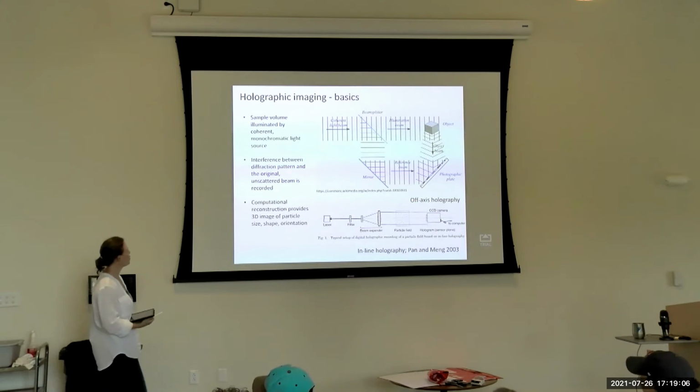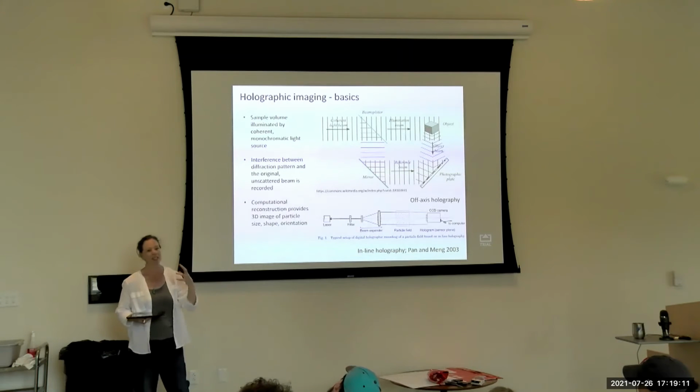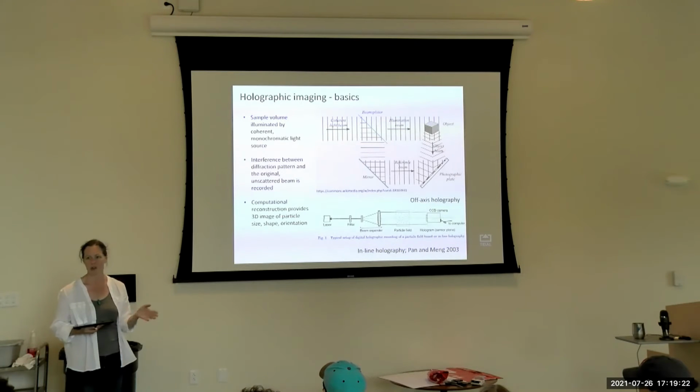So the 3-dimensional image of the particle field is basically based on diffraction, right? So we're gonna see the particle size, shape, and orientation if it's an in situ instrument. We're not gonna see its absorption or interior structure as much. We're looking at diffraction pattern.